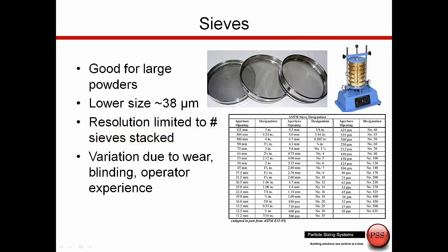So this is a very good technique, been around a long time, great for powders. There's some variation due to the wear of the sieves. Blinding has to do with what size particle can really fit through a given opening, and also the operator experience, which is true for most of these techniques.